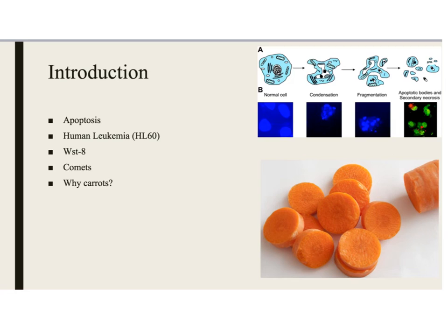An important part of this project was WST8, which we treated our cells with because when it's added to cells, it will produce a water-soluble yellow/orange colored dye upon its reduction in the cell. Viable cells will be seen at an absorbance of 450 nanometers. So we looked under the microscope for this.